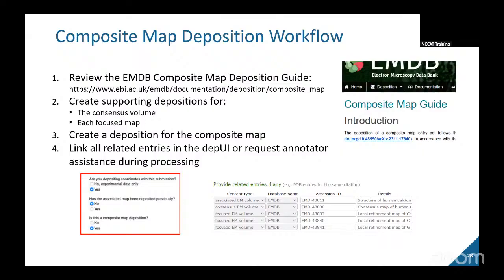Because in the paper, you'll have a workflow, but usually what you'll have is just some uninterpretable list of 50 different PDB and EMDB IDs at the end of the paper, but no way to easily tell what's what. It would be great if there was a way to deal with that on the EMDB side, so it was easier to comprehend for these complicated cases.